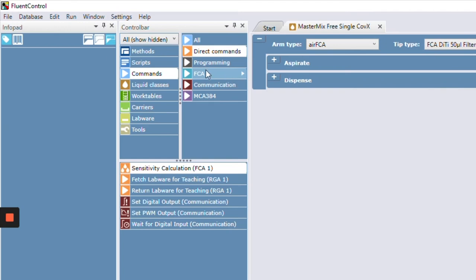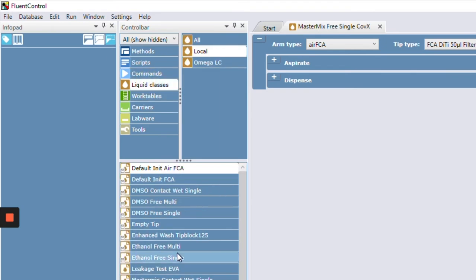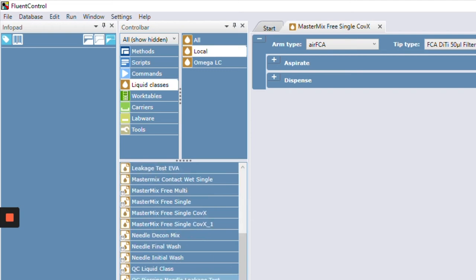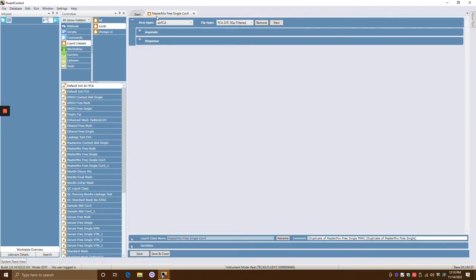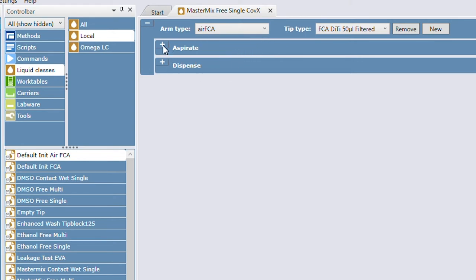Liquid classes lives right here under the control bar. You click on liquid classes and you can see all the different types we have. Keep in mind there's a different type of liquid class for the MCA versus the Air FCA — the Air FCA has way more options than the MCA.